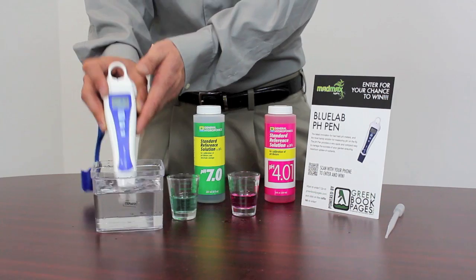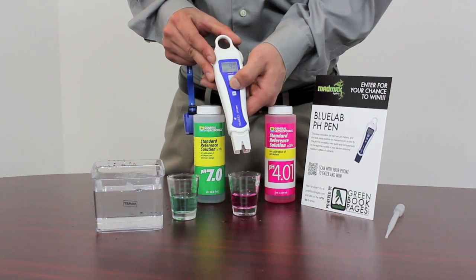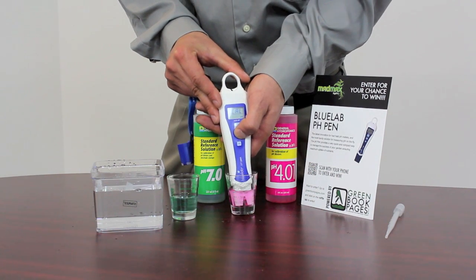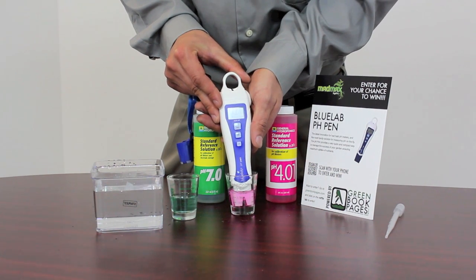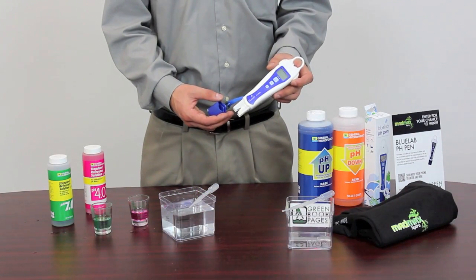It's important that you rinse your device in between measurements. Next, you'll continue the process with your pH 4.